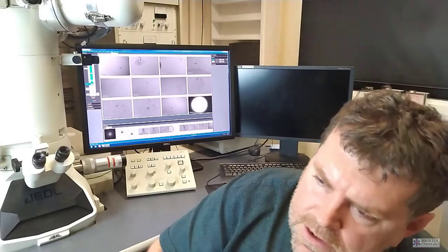So there's not really a default option for this particular instrument. The other transmission electron microscope we've got, it runs at a slightly lower accelerating voltage. It's a more robust instrument and it keeps its electron optical alignment and focus a bit more consistently. So we use, we can train people up relatively quickly on that instrument so that they can use it just for literally digitally recording or image grabbing from their samples without having to fine tune the alignment to be able to get meaningful and quantitative data.